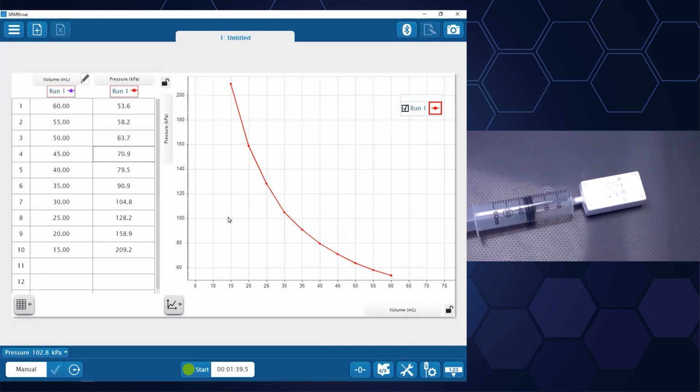At this point, I want to start talking about getting our students to do this. And I want them to kind of separate the mechanics of collecting the data and separately do some recording. And I'm planning to give them some instructions on this, but I don't want them to have to set all this up. I want the lab time to be used for data collection and, most importantly, analysis. So let me start to think about how I can take this file and make it into something that I could give to students.